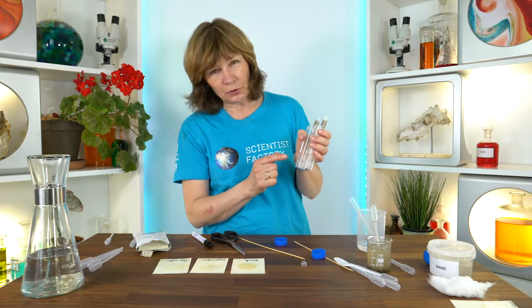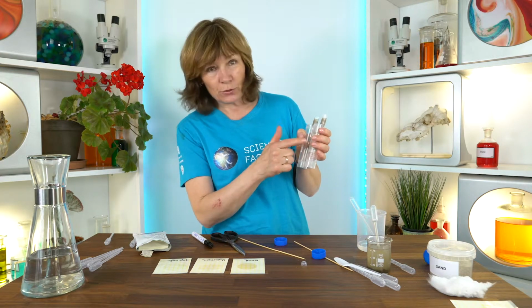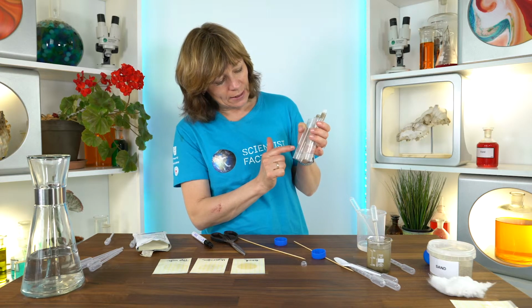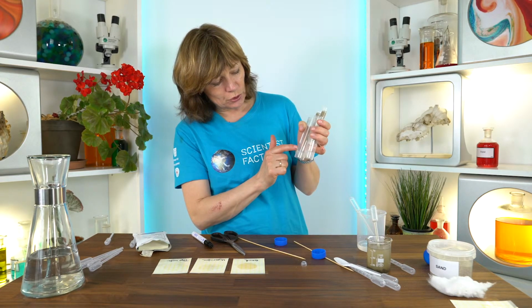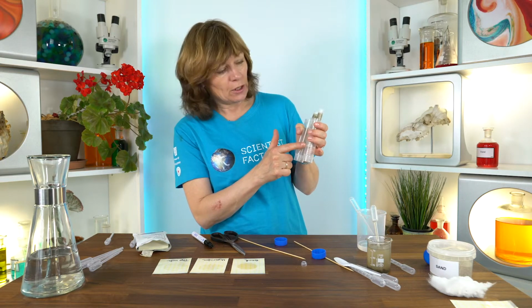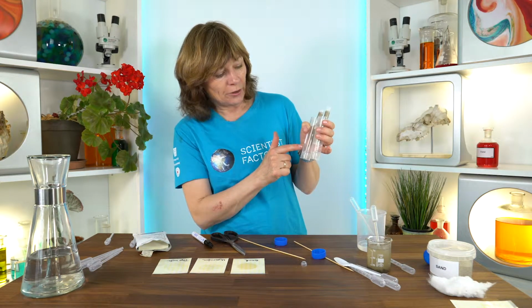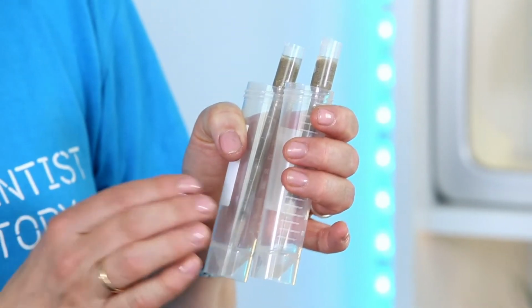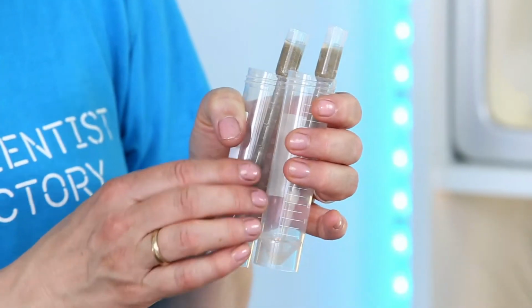And then I want to give you a little tip. If you look at these two columns, the water is running faster in this than in this one. And that's because here I used a rather small piece of cotton, but a much larger one here. So I suggest that you are careful that your students only use a small piece of cotton, so it doesn't take too long to get the water through.